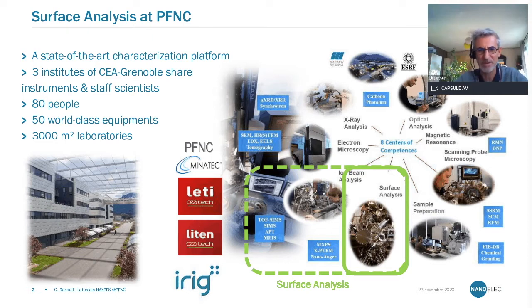And one of these Centers of Competencies, one of these teams, is a team I am more particularly leading, and this is related to surface analysis using photoelectrons, and with some extension towards ion beam analysis, so-called TOF-SIMS.